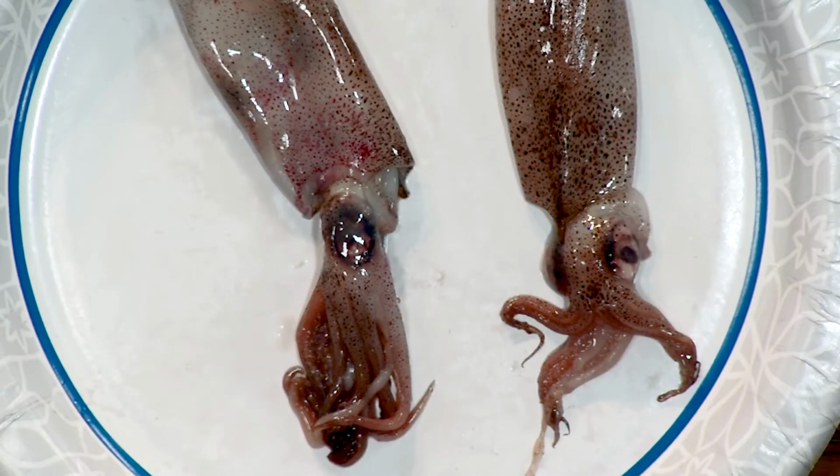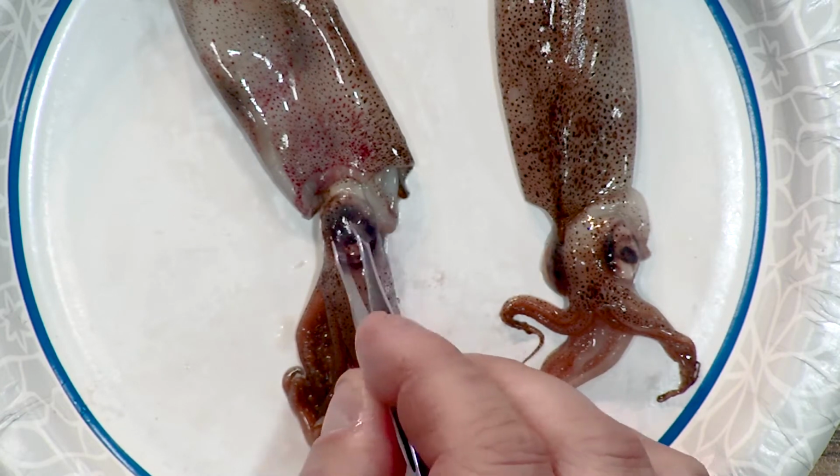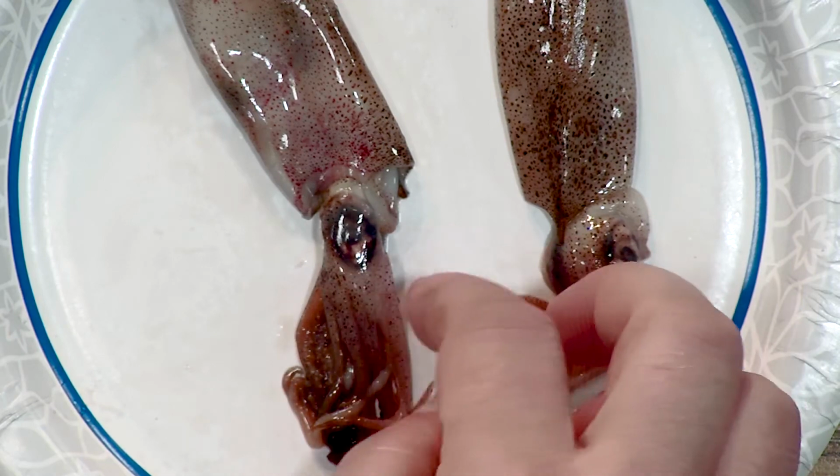So if you investigate this eye, it's a little cloudy here in the middle because there's fluid there. But behind that, it's got an iridescent shine to it, a very reflective looking eye.